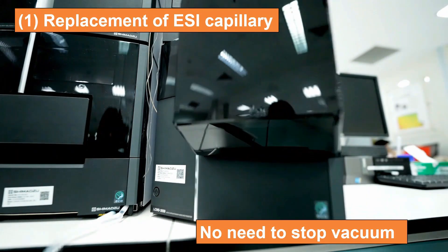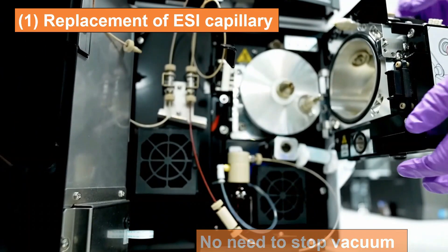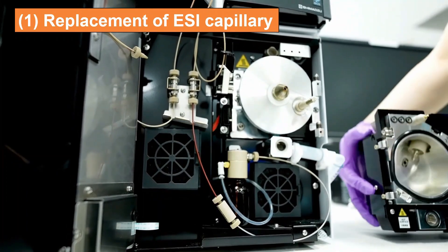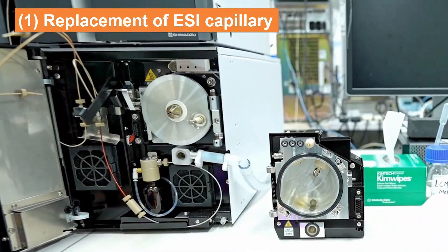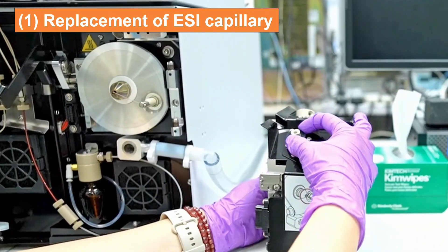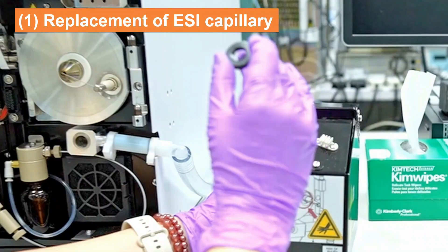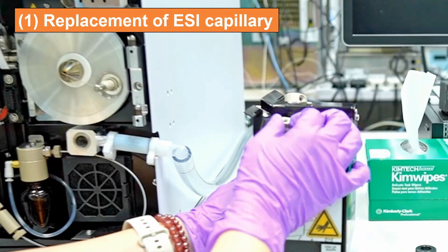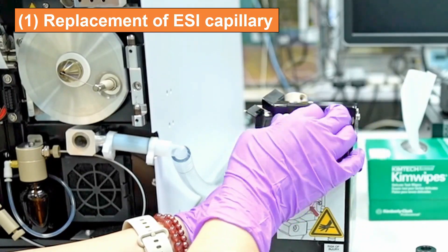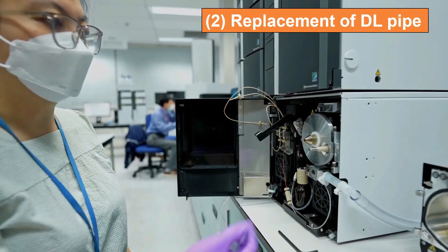Let's start with the replacement of the ESI capillary. There is no need to stop the vacuum for replacement of the ESI capillary or the DL pipe.